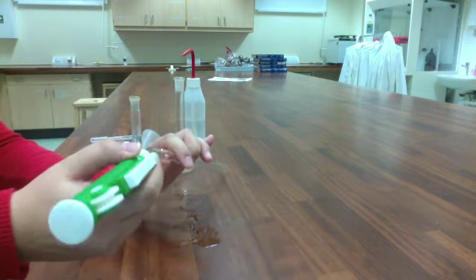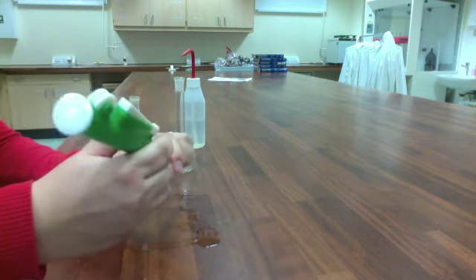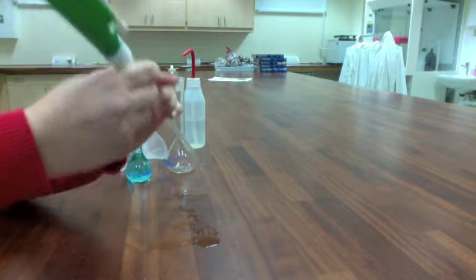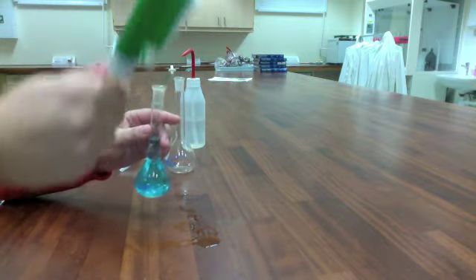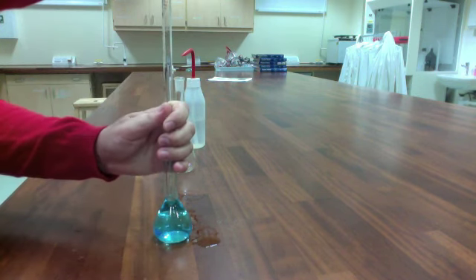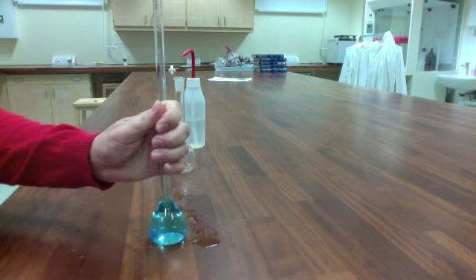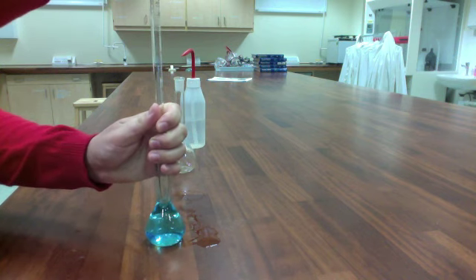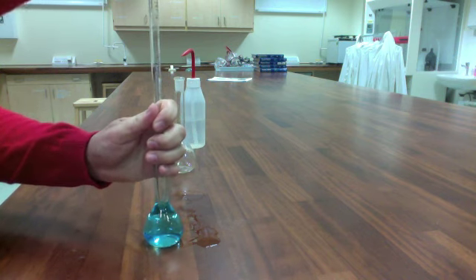We'll just put the pipette bulb on the top. You don't need to jam it on, it just kind of slides on. Then put the pipette into the volumetric flask. Make sure that the point of the pipette is not touching the bottom, or else it will be impossible to draw up any liquid.